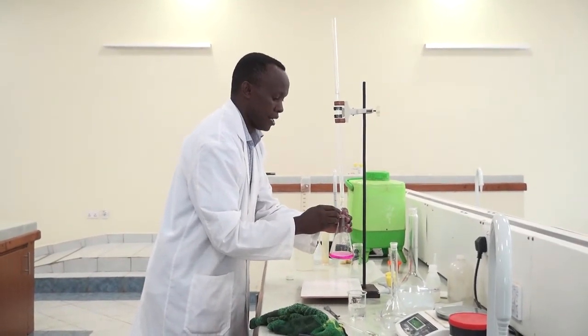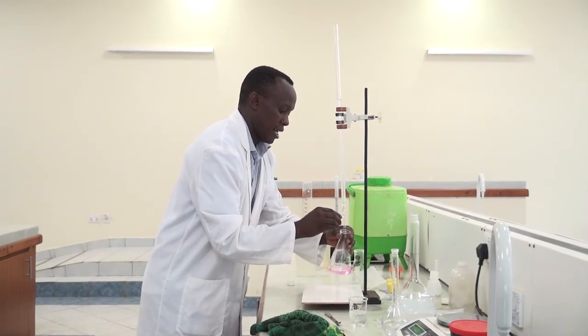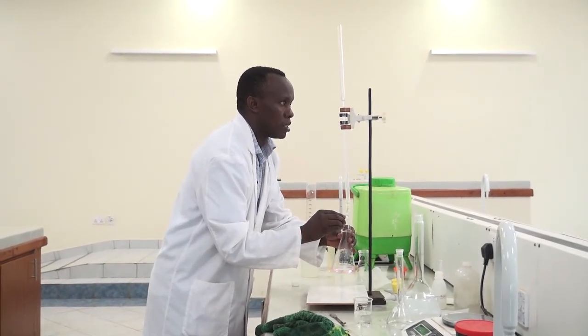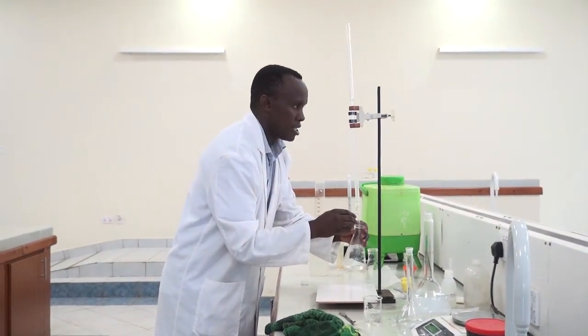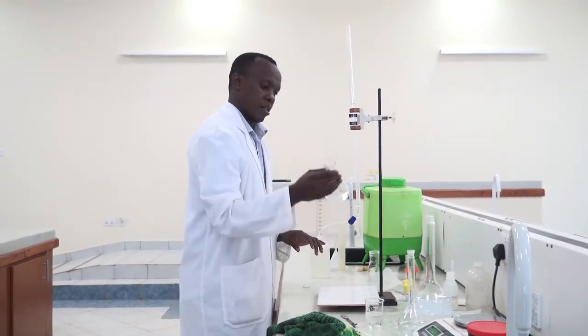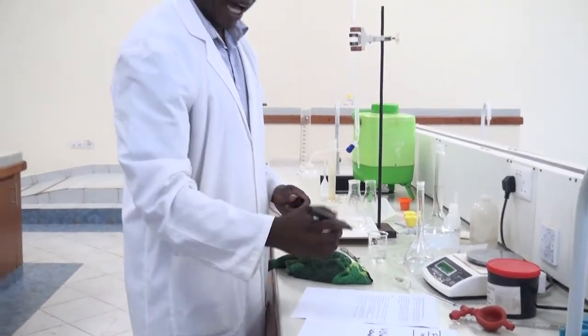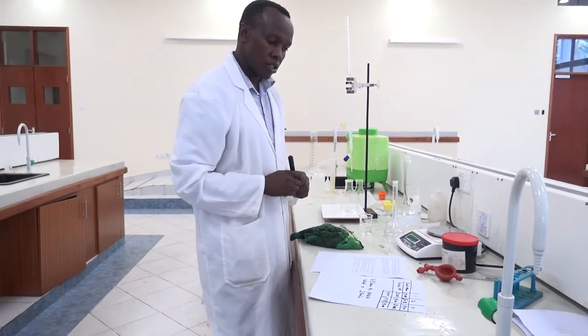So there I am. I've added up to 18. Then from there, I can add drop by drop until the pink color just disappears. There I am. Now the endpoint has been reached, started at 0.0 and ended at 19.0. So I have done now with the titration.